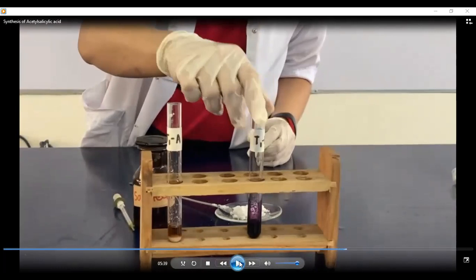So as you can see, it turned violet. That means there is a phenolic compound in test tube number 2. So later on, during the PowerPoint presentation, I'll explain why it turned violet. Test tube number 2 turned violet, rather.